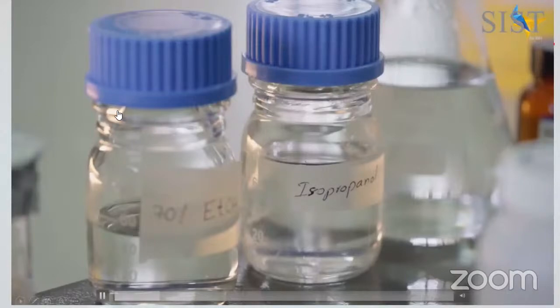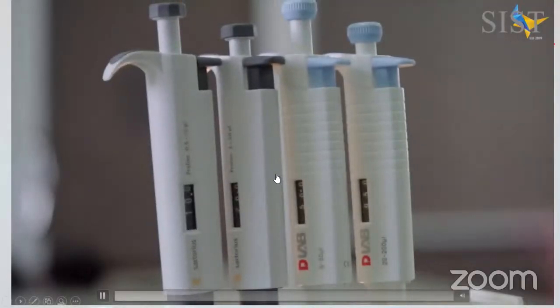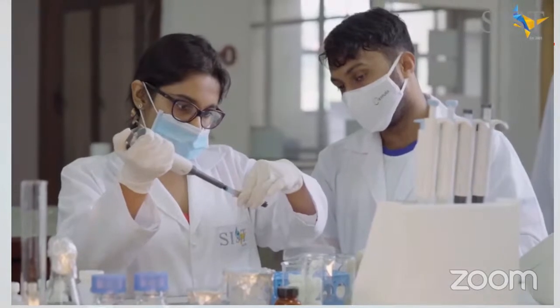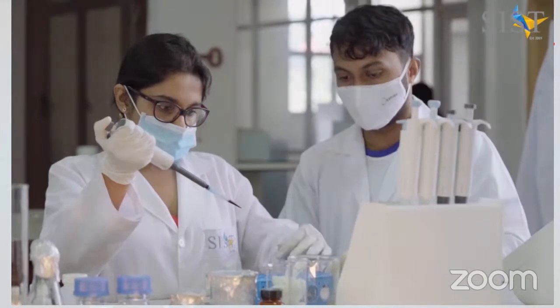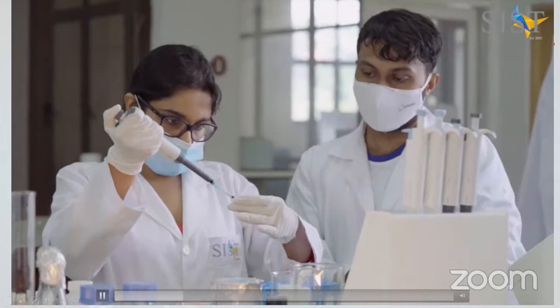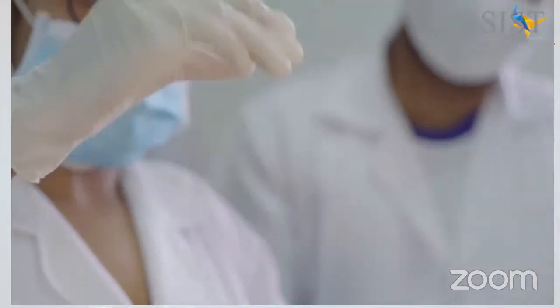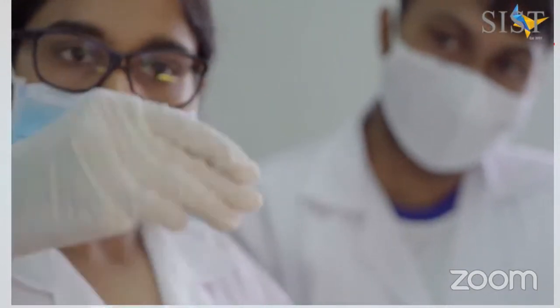The tubes should be very well labeled and the micropipettes should be arranged prior to starting off the procedure. To commence the procedure, you add freshly collected blood into a microcentrifuge tube containing the cell lysis solution. The blood should be freshly collected as it will result in a quality and a good quantity of DNA following the extraction procedure. The contents should be mixed well by inverting the tube for a couple of minutes.